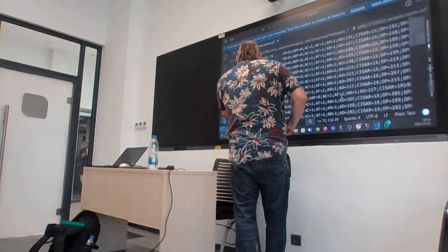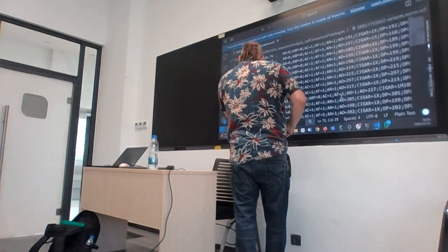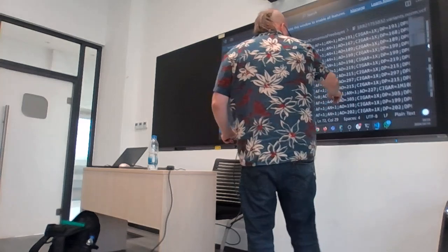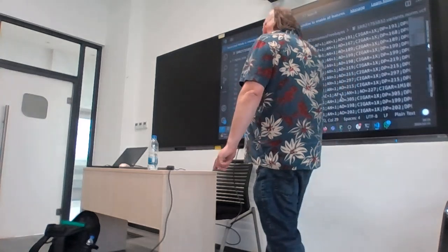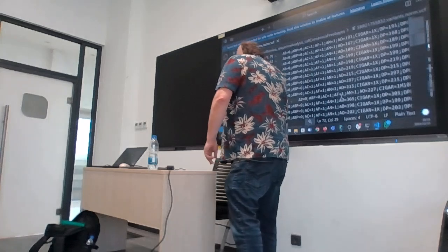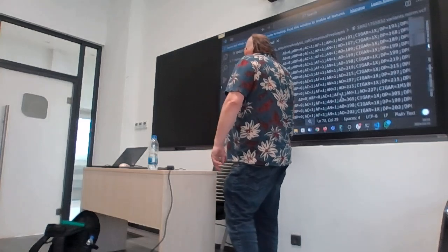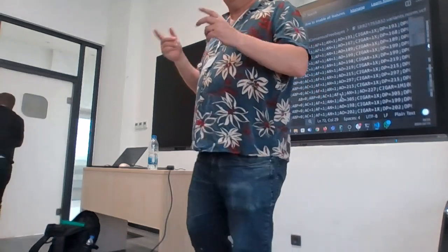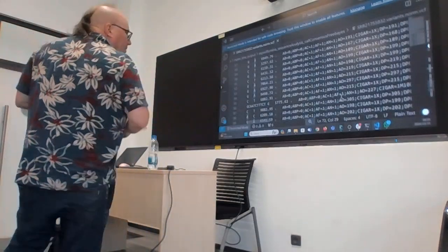Okay, that's 10. Good. This is coming in here, allele fraction 1, 200 reads, and it looks like, I have to look at it carefully, but that looks like that is not... This does not add up to multiples of 3, so I'd have to look closely to see, is this a frame shift? I don't know. I need to look more carefully, okay?